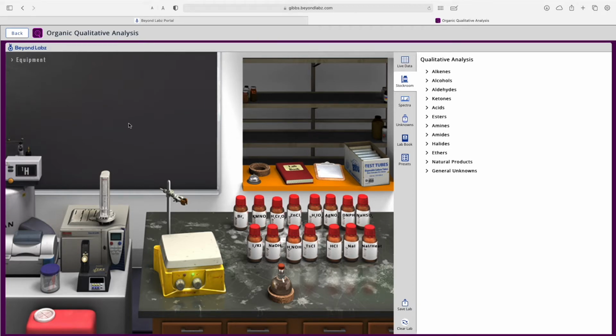This video is just to give you a brief overview of the things that this lab can do, as well as some of the features that it has. If you want more details on these, please check out our other videos on Vimeo.